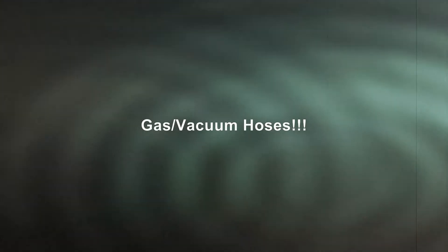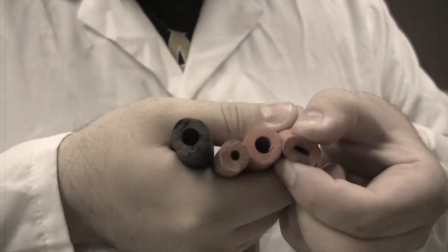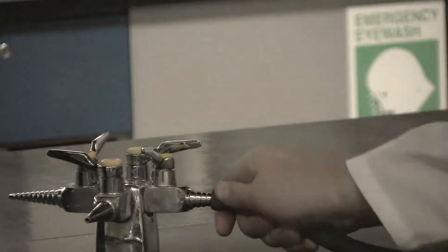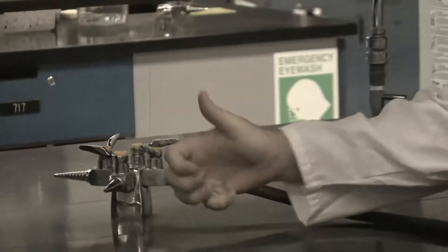Now for gas and vacuum hoses. Note these come in all shapes and sizes, and there's not one particular color per water or gas. These ones have a thicker outer diameter and cannot be crushed as easily. They are a lot tougher to put on the vacuum nozzles or gas nozzles.